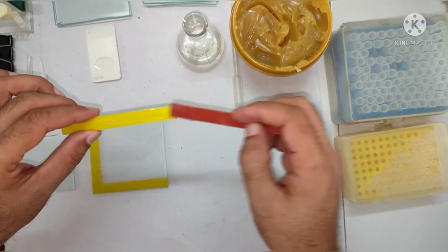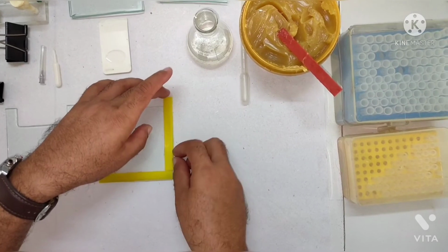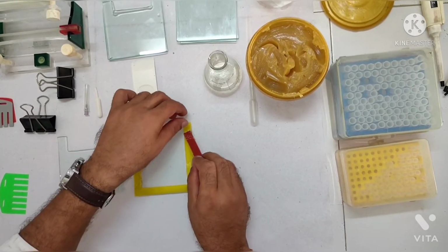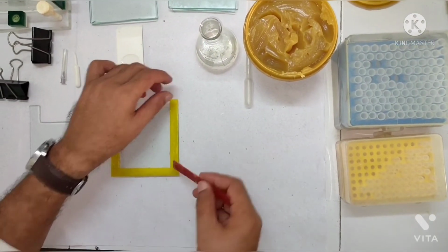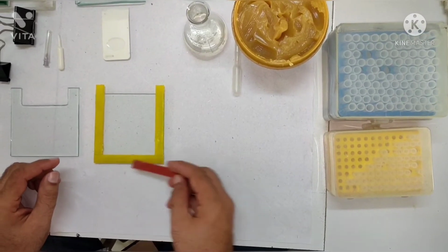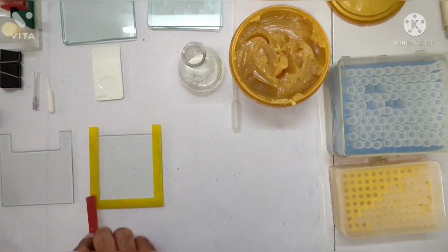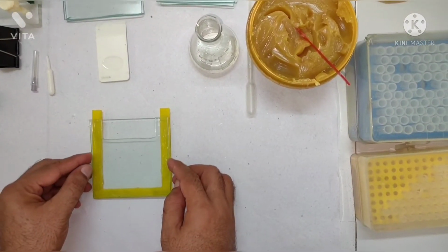Moderate amount of grease is all right, okay. So this is the third spacer, all right. And now you can put some amount of grease on the top of the spacer also, so that the other plate can fix easily, okay. See, I'm again mentioning here, there is no such thumb rule to put the grease, right? This is just to align your plates well as the chances of leakage also become less, right? But for making the gel leakage proof, we seal the gel with the agarose also, right?